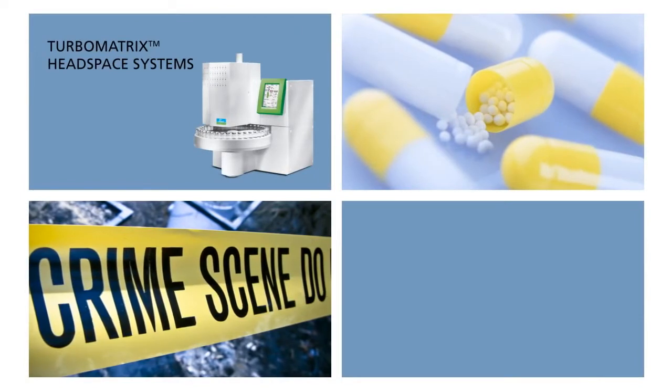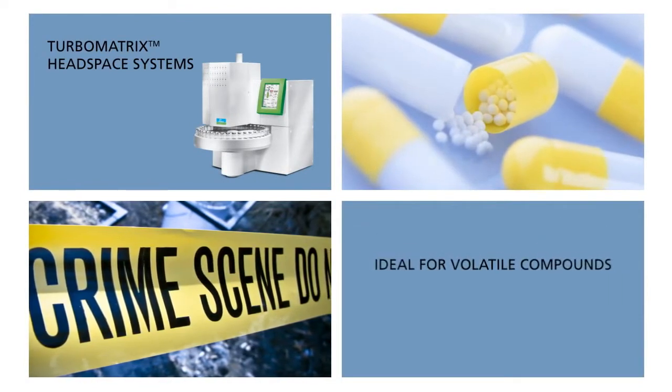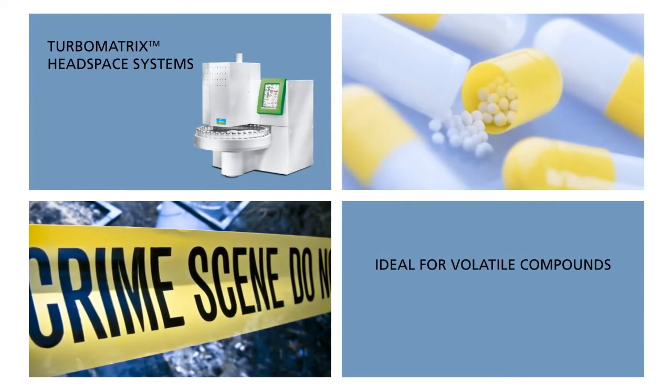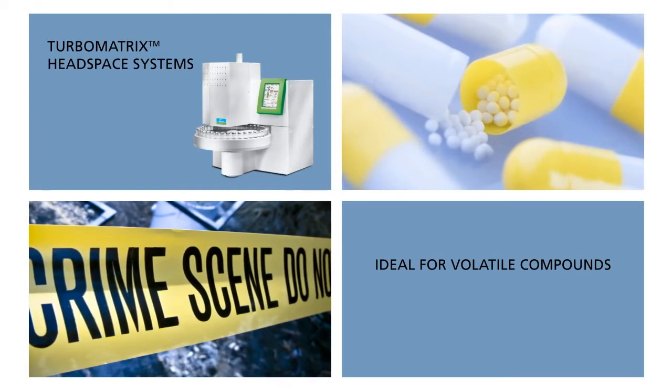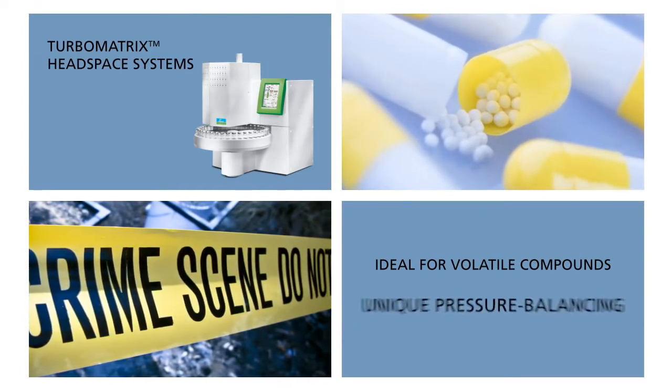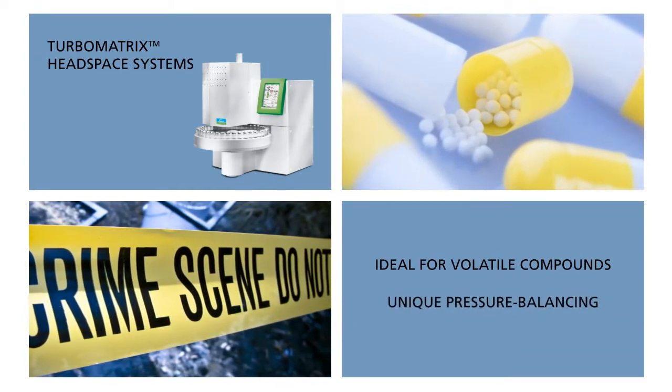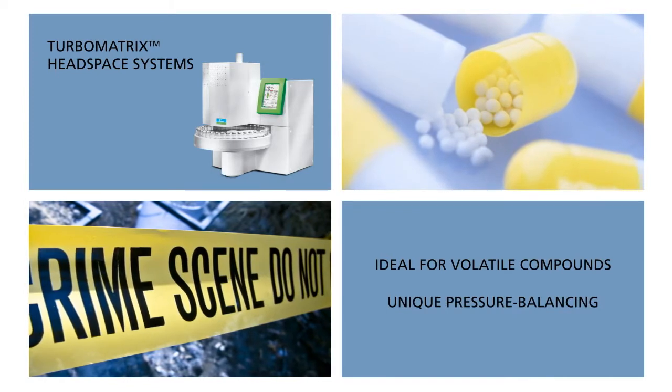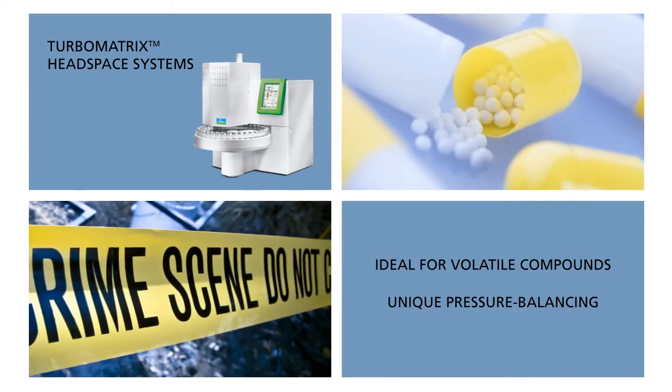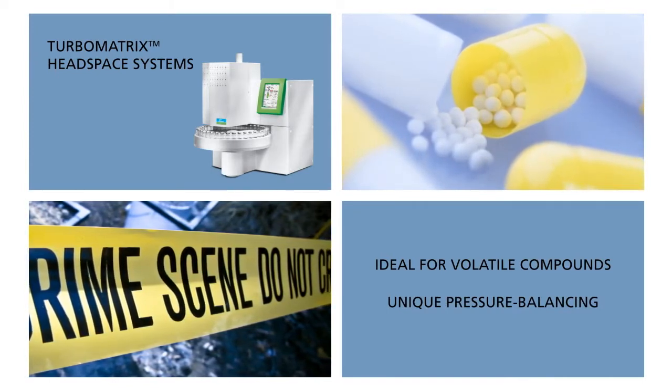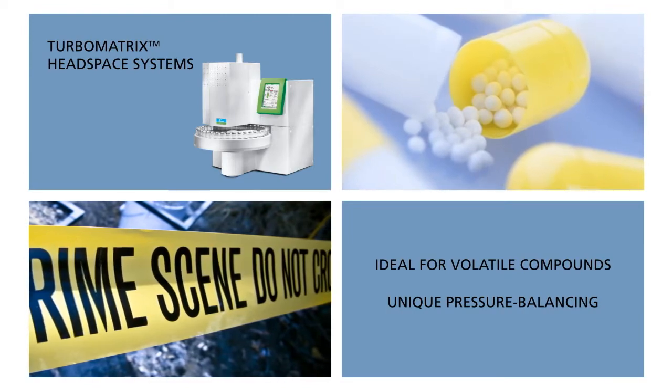Ideal for virtually any analysis involving volatile compounds, PerkinElmer's world-leading TurboMatrix Headspace and Headspace Trap systems feature a unique pressure-balanced sampling capability that allows samples to be introduced into the column without the use of a metal loop for sharper peaks and more accurate data.